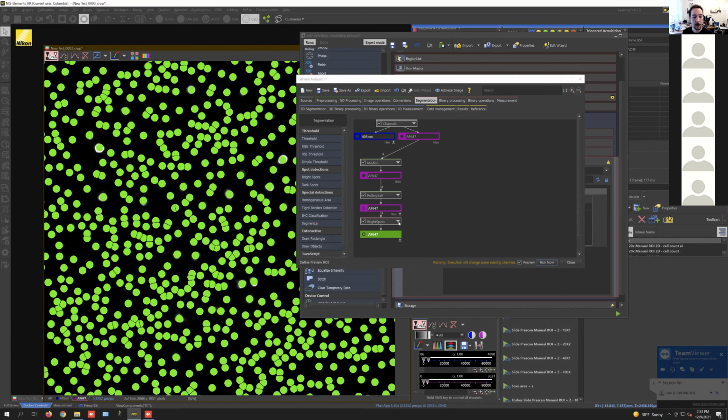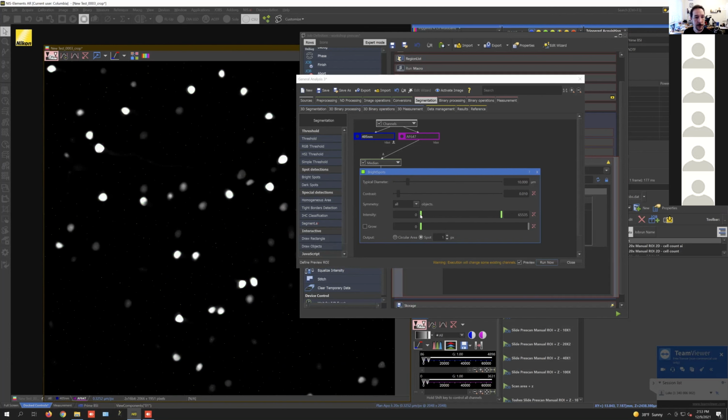And if I click in here, I'll be able to see the options for doing this. And right now we haven't got a threshold for the intensity, so we need to come up a little bit. I find the circular area is a little bit hard to look at, so if I switch this to spot, it's going to be a little bit easier to see. And then hopefully it'll let me bring this intensity up. I can make the spot a little bit bigger so that it's easier for you guys to see as well. So you can see this very quickly.